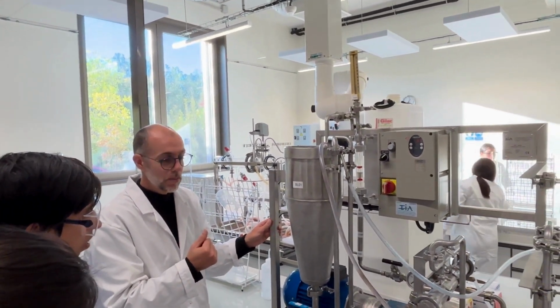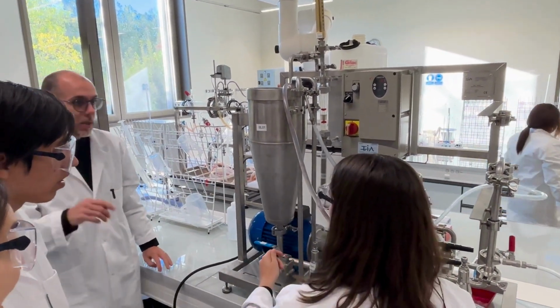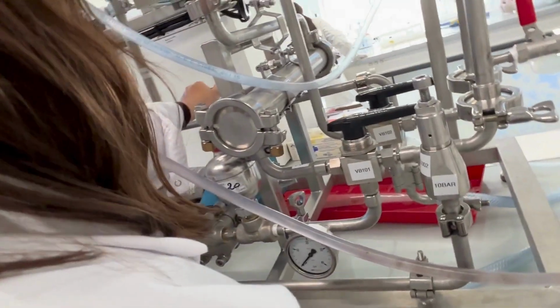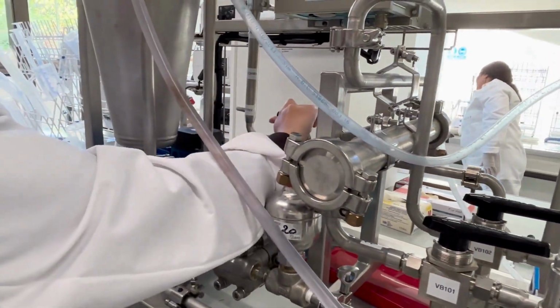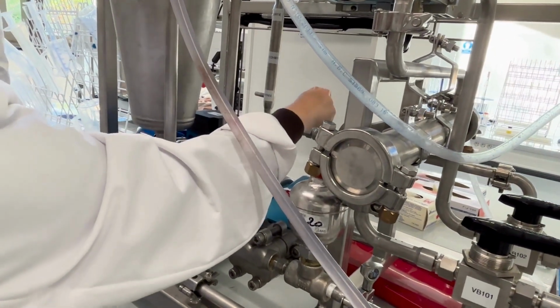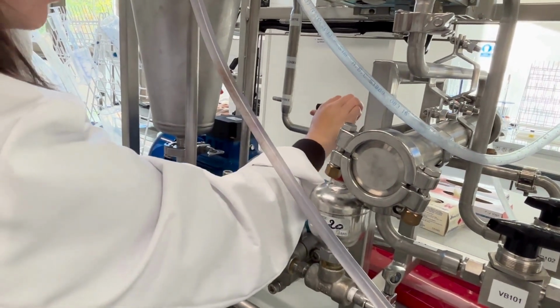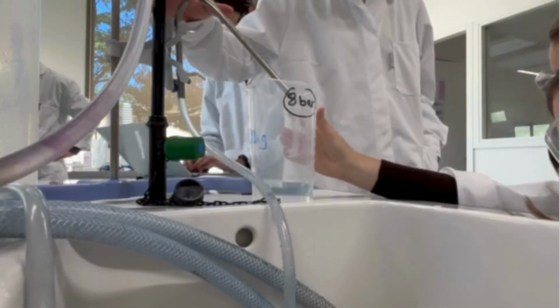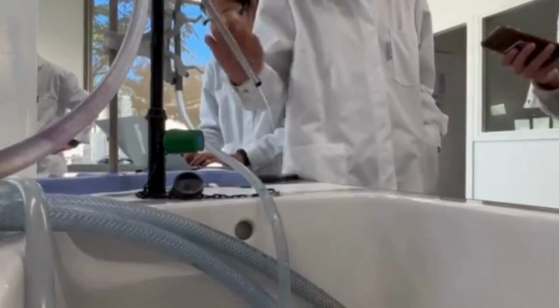Start pump PA1 and increase its speed until a flow rate of 500 liters per hour is achieved. Allow the pump to run until all air is expelled from the system through the retentate and permeate outlets. Next, increase the pressure to 15 bars by gradually closing the VR51 control valve. Continuously monitor and adjust the pressure and flow rate to maintain 500 liters per hour and 15 bars throughout the filtration process. Finally, collect the permeate in a separate container for analysis and observe any changes in the retentate.